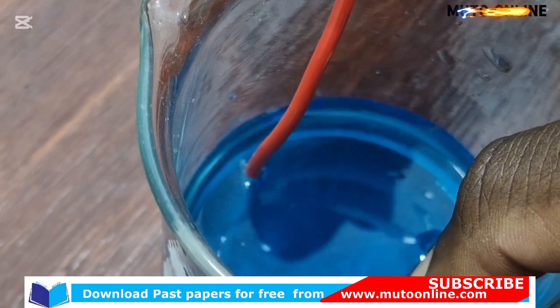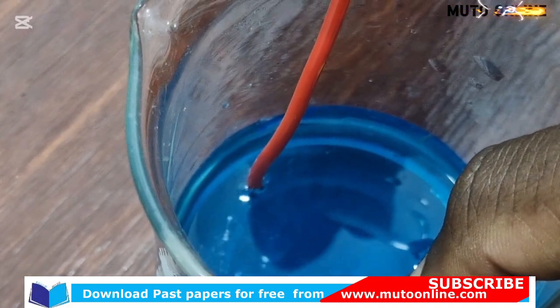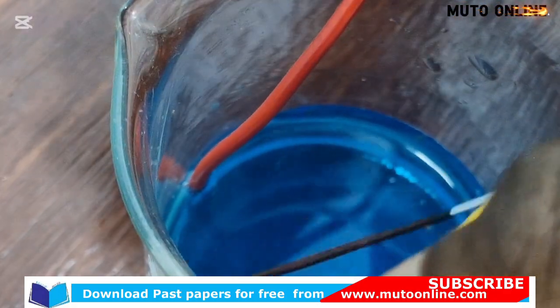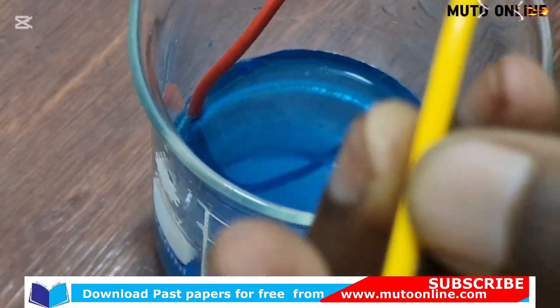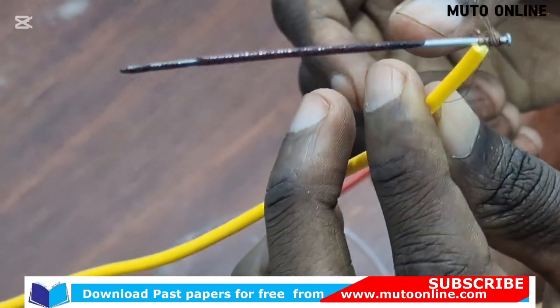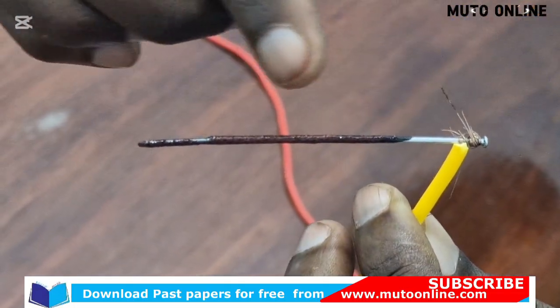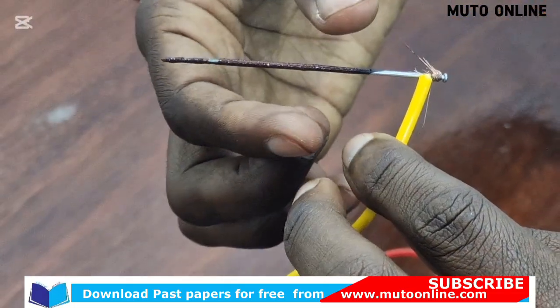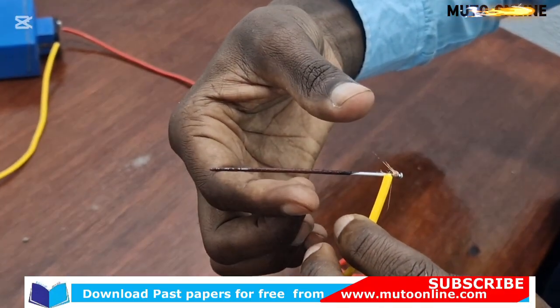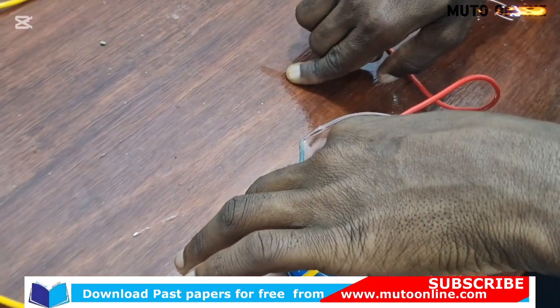If we had the way of collecting the gas, we could see that it can relight a glowing splint. But we use the pin as our cathode. We can see there is deposition of a brown solids around it. We are noticing some increase in the size of the pin. I think we cannot see it. This is copper. The solids formed are brown in color.